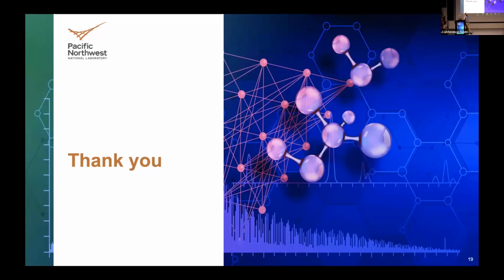Gotcha. So for this particular software, we are targeting a very specialized data analysis that comes from a pretty specific experimental design. And apologies for time, I didn't really go over the experimental side of things, but it does involve a modified ion mobility instrument that can do this ozonolysis.